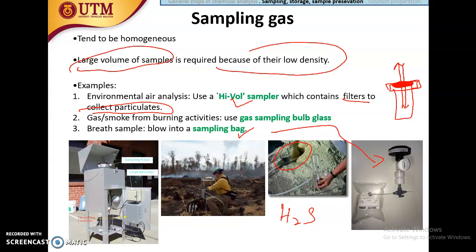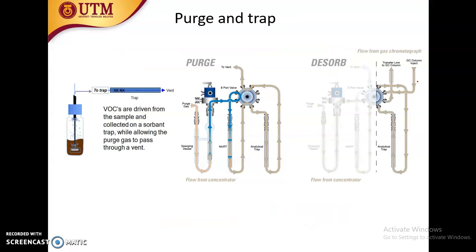It means that it is tightening up the vial. After that, you can go into GC, if gas is your sample.